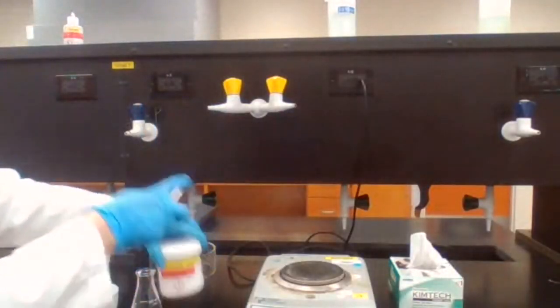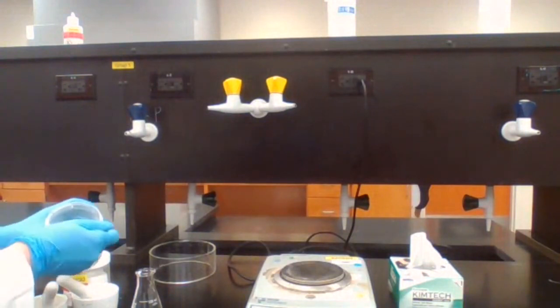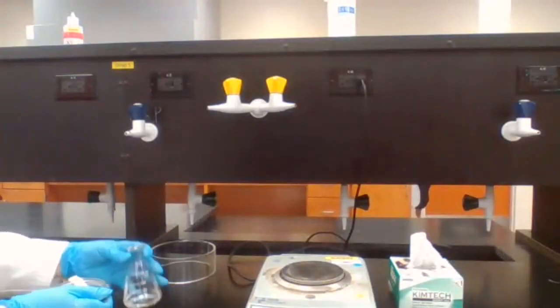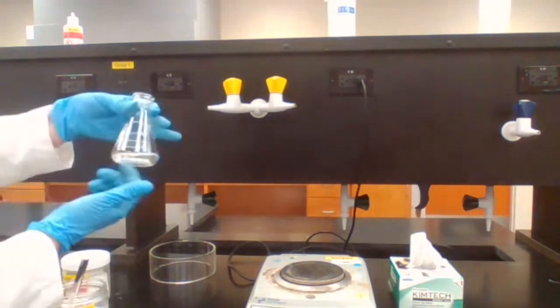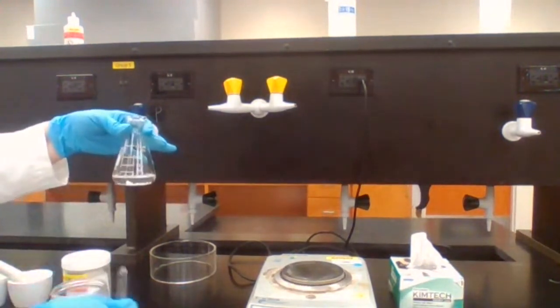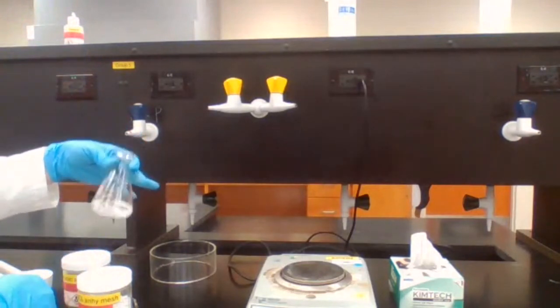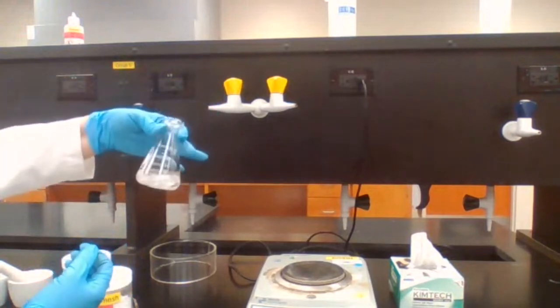Then we add calcium chloride. How much calcium chloride should I add? There should be no quantity there. It just tries to make you students not think. The more moisture and water you have in the organic layer, the more calcium chloride is needed. It's very important to close the calcium chloride container right after use. Otherwise, it would absorb moisture from the air and get like a piece of rock and is not efficient anymore. It would be hard to use.